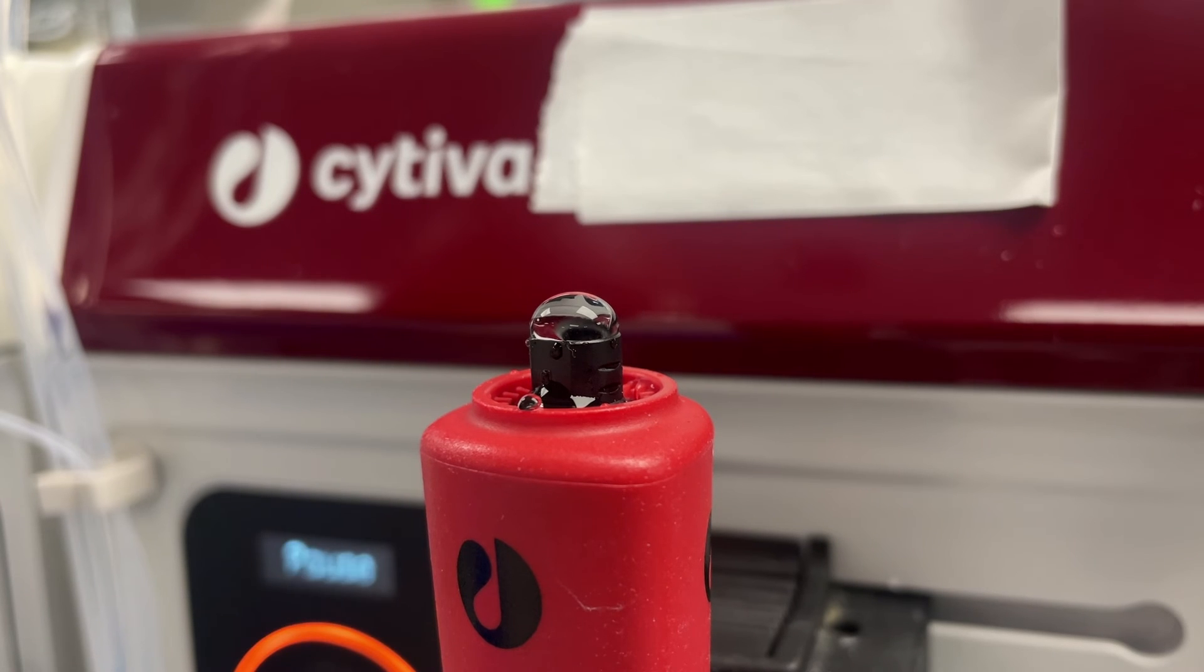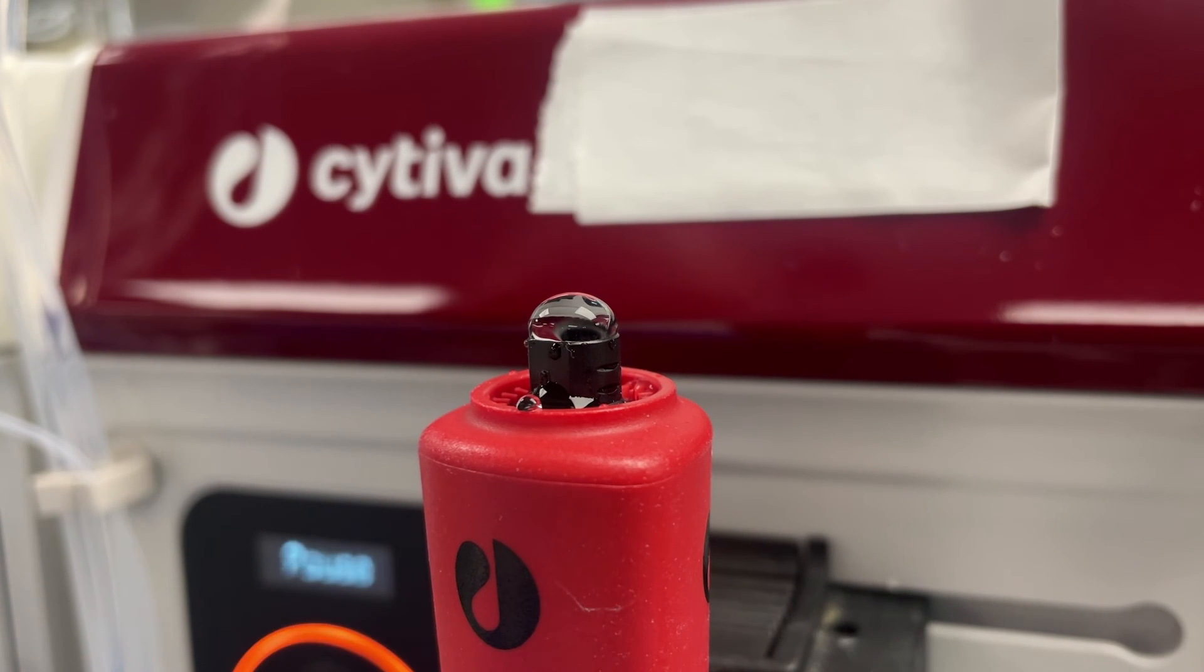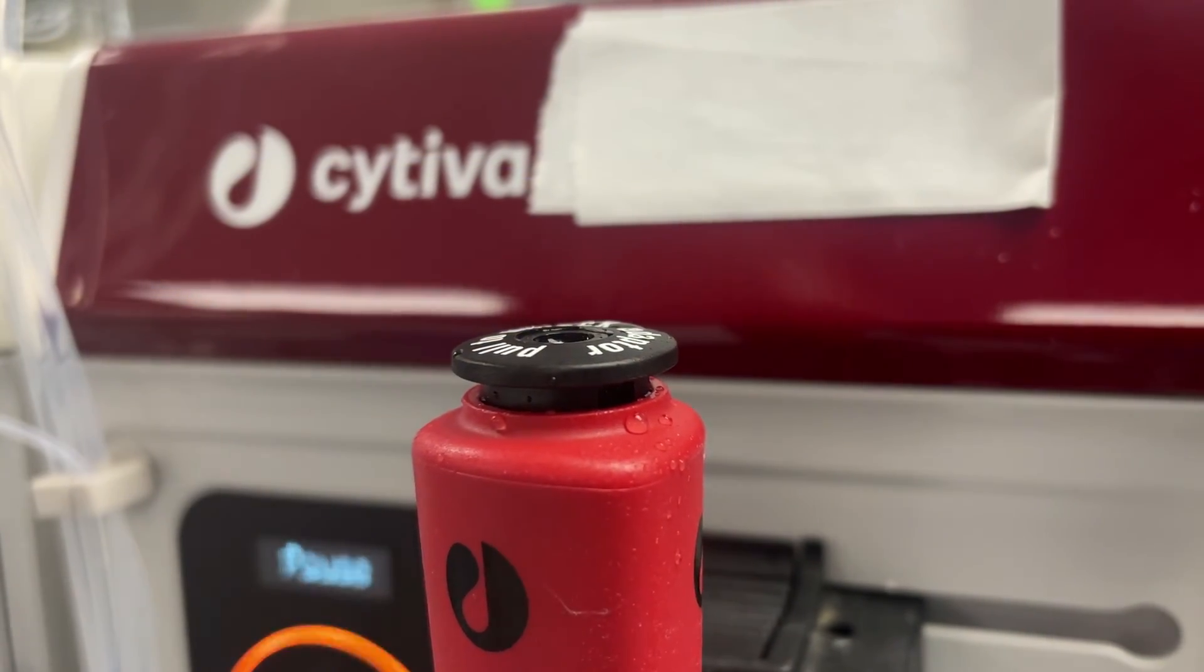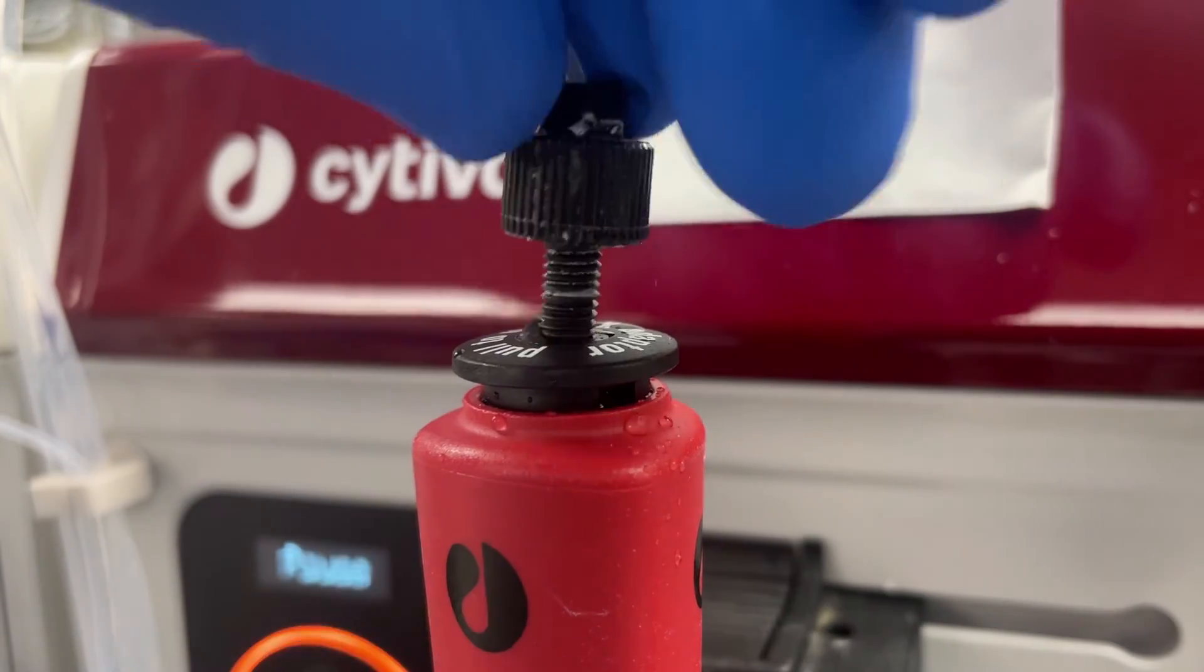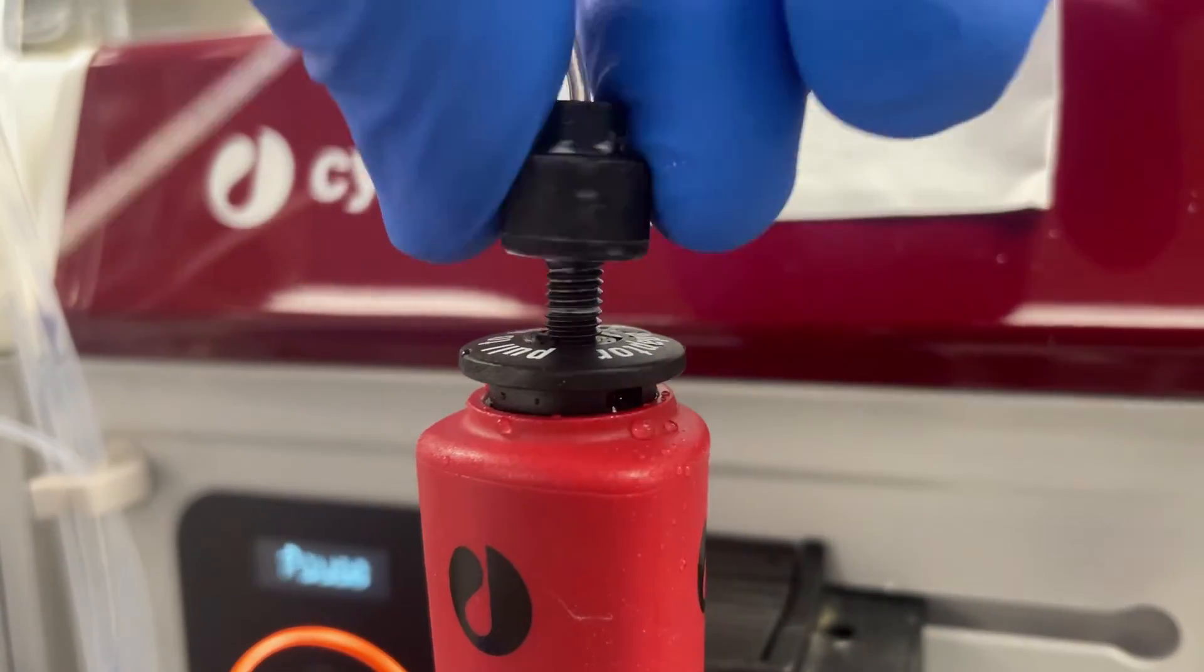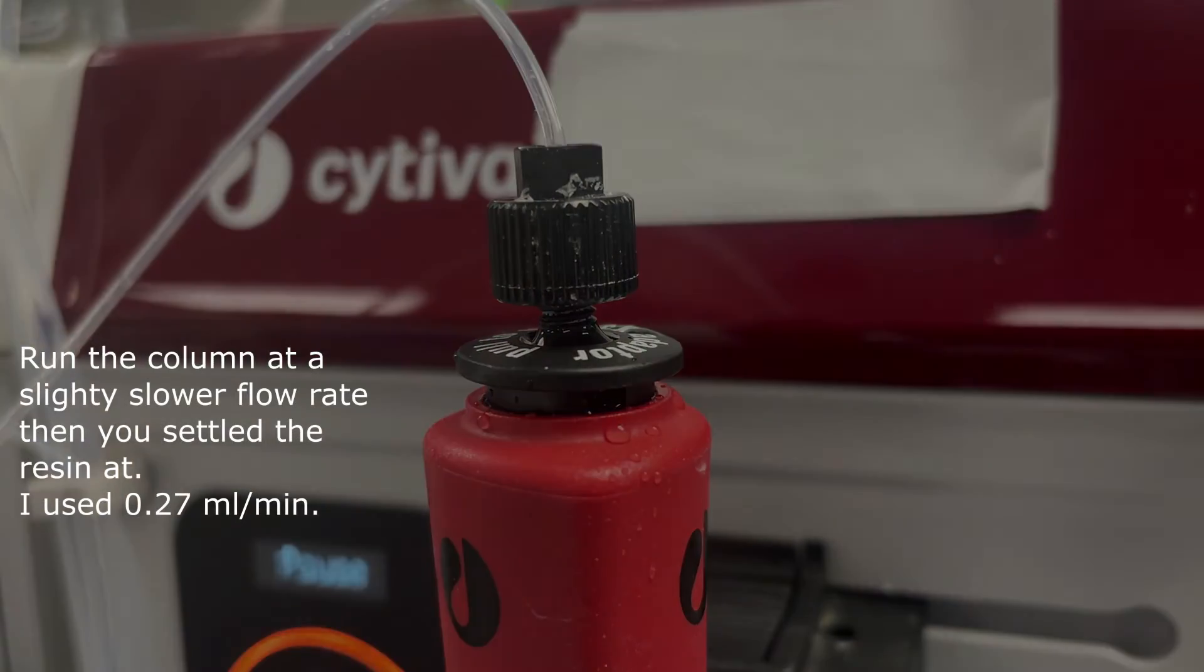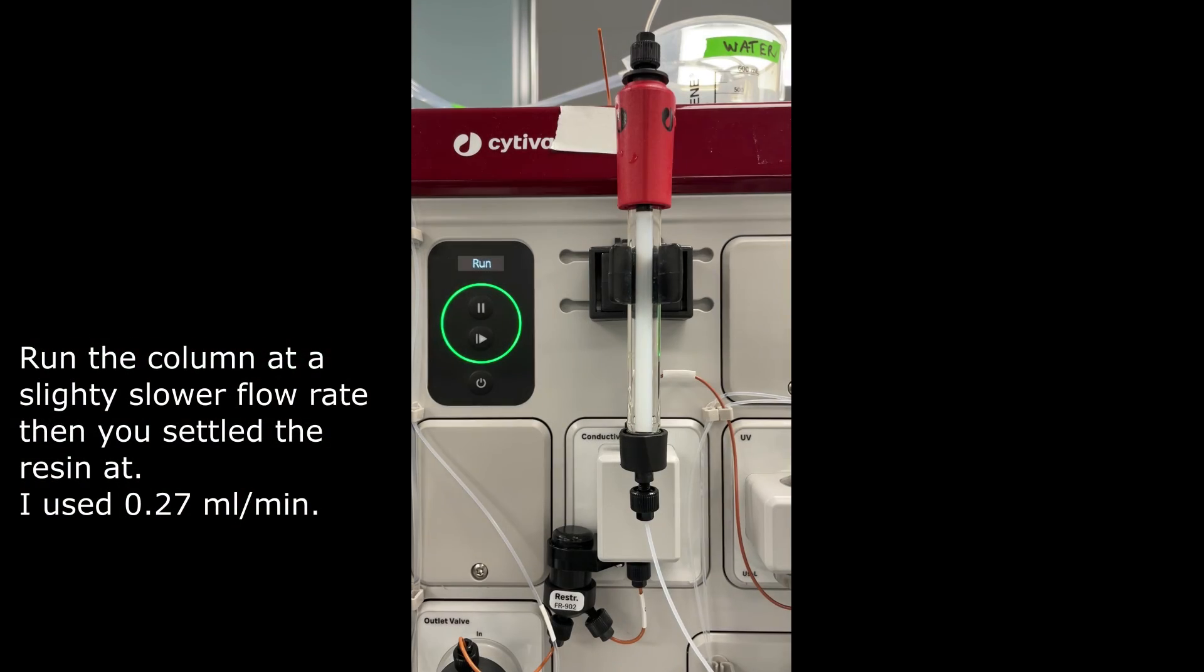Alright, we'll put the lock on top of the adapter just to keep us from turning it anymore and messing up the resin bed, and we'll hook it back up to the chromatography system so we can run it a little bit longer. That will help us make sure that the bed is stable in case we need to do some readjustments or anything.